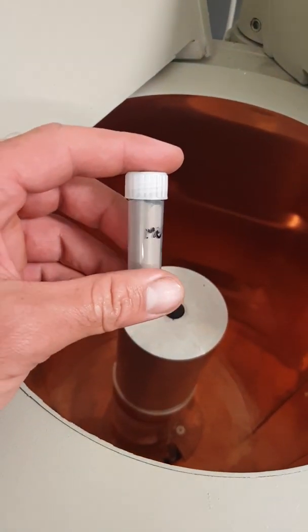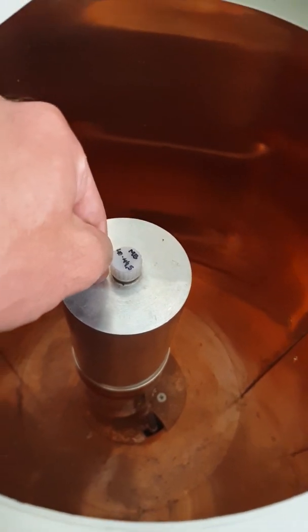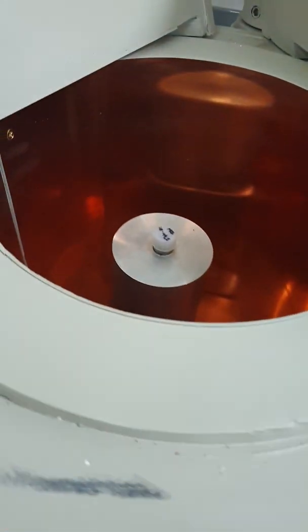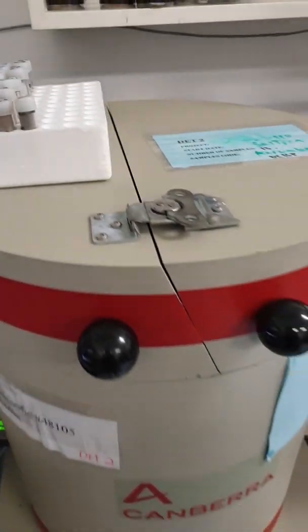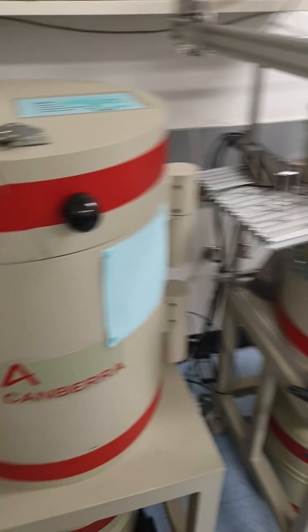We take our sediments like this and put them in here. Within this is a highly sensitive electrode which detects naturally occurring radioactivity every time there is a decay. Within that sediment sample it will be picked up by this machine. To eliminate background radiation from entering our sample, they're encased in lead, so we can see this lab is very heavy.